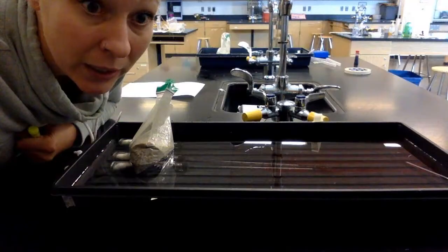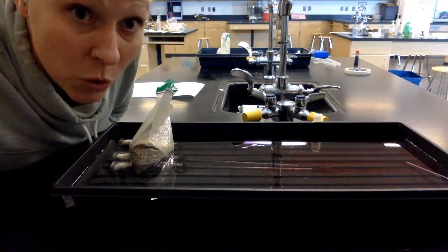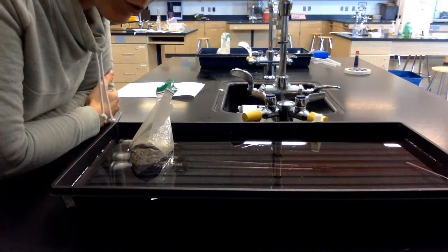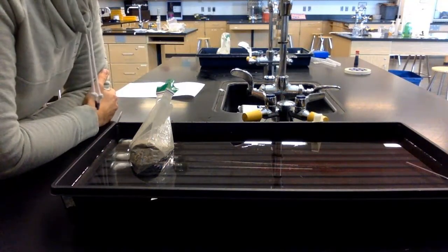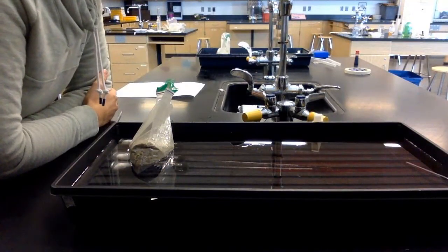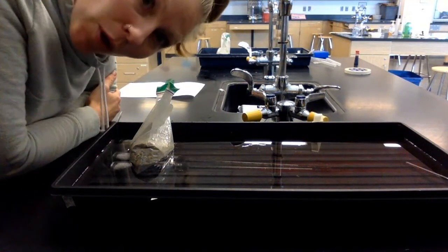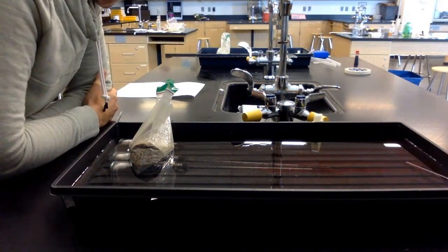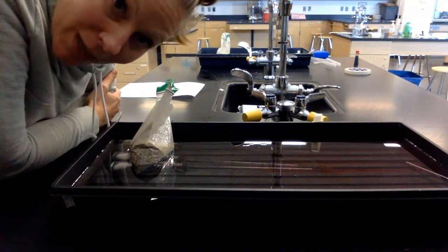At minute 20: respirometer one is 0.64. Respirometer two is 0.85. Respirometer three is 0.90.